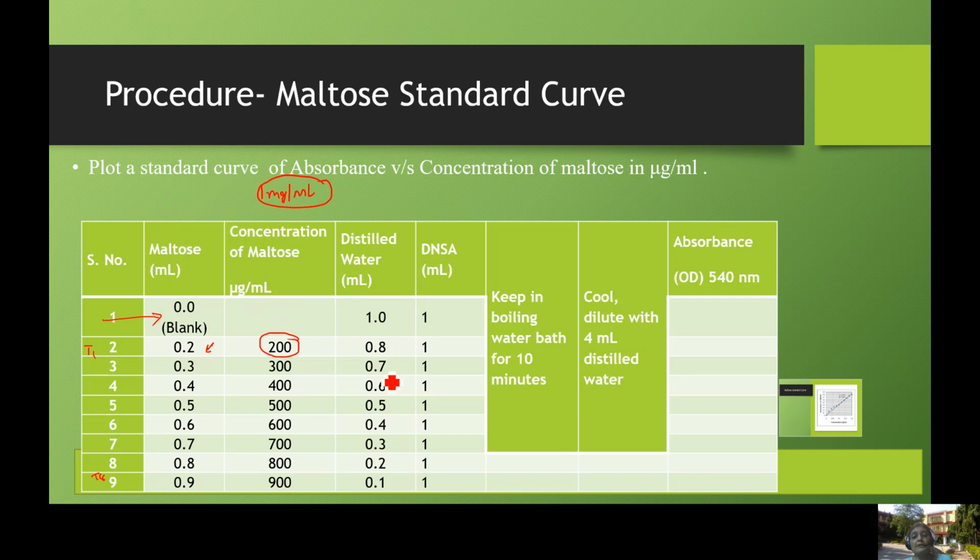The remaining will be diluted with water. Shake it after adding water and then add 1 ml of DNSA. When you start adding 1 ml of DNSA to your blank, you have to start your stopwatch. Continue the addition of 1 ml to all 9 test tubes and allow the test tubes to remain undisturbed for a total of 10 minutes starting here.